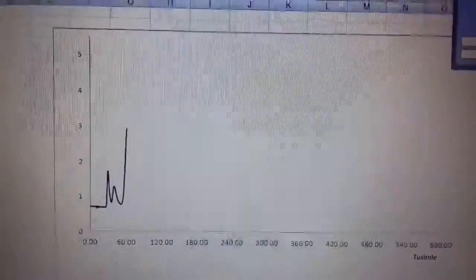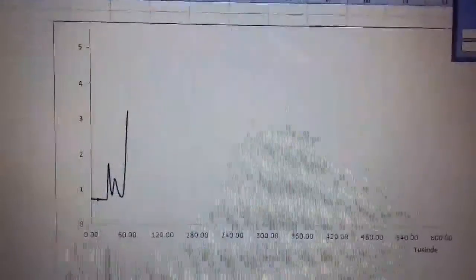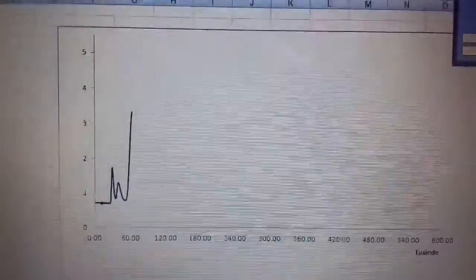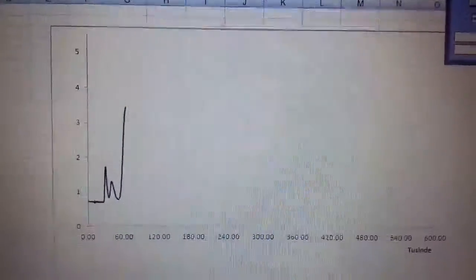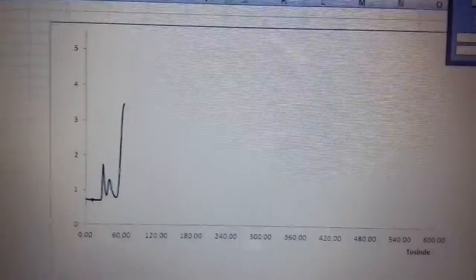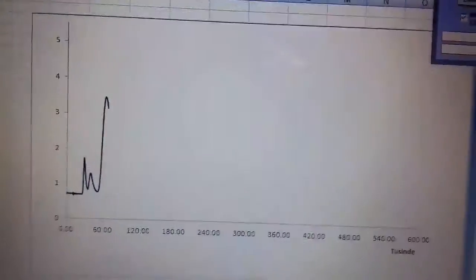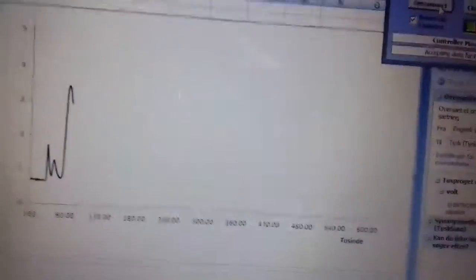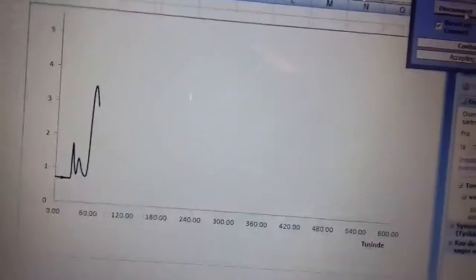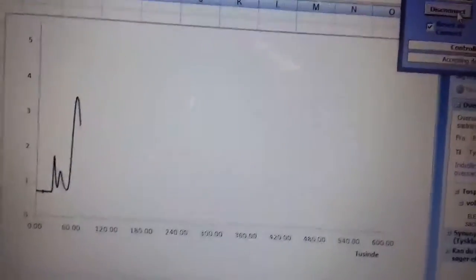That is of course not what you'd call a commercial quality chromatogram, but considering it's done on three feet of column packed with cat litter, I think that's okay.